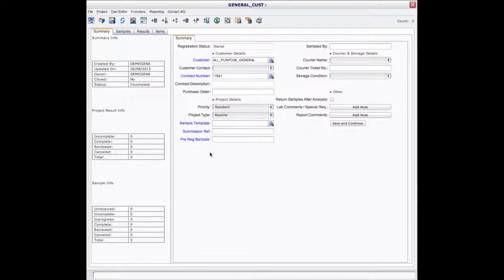With the new Virtuallabplus system, we are presented with all the functions we need in a simple and straightforward user interface. Going through this page, we'll find on the top here the quick icons. Starting from the left is the exit, with similar function to this X button, not to be confused with the Windows close button. Right next to that is the open icon, which allows us to open any project within this project manager page. We will cover the rest of the icons later in the process.